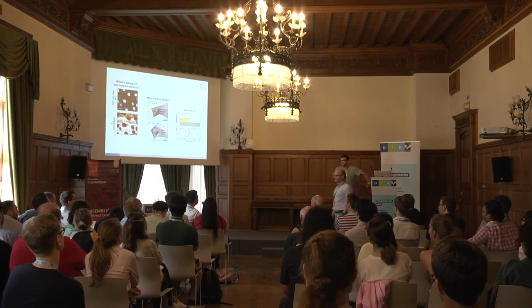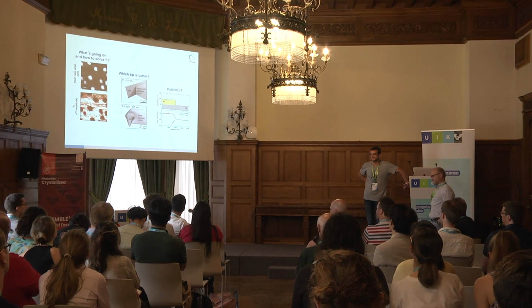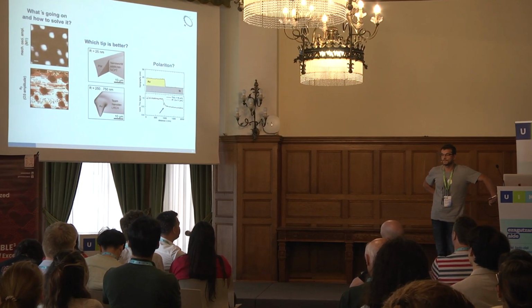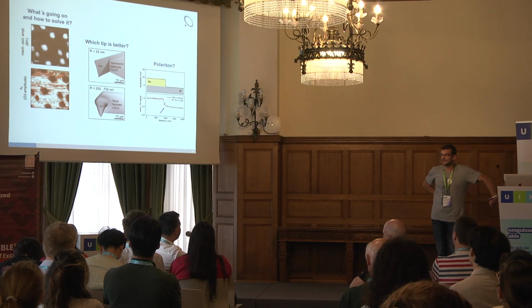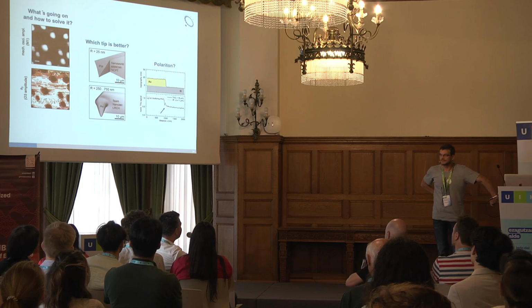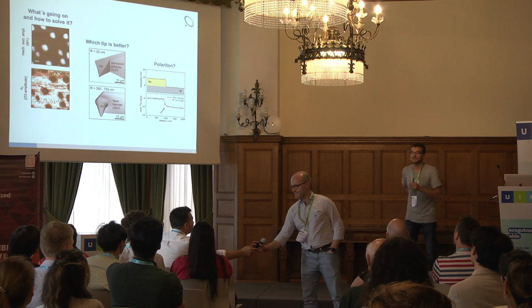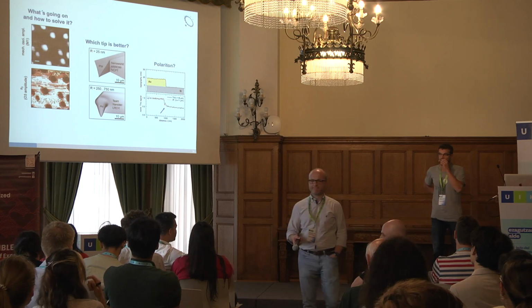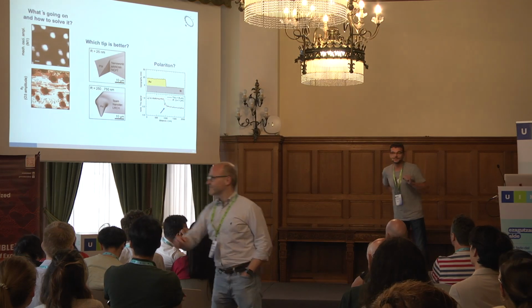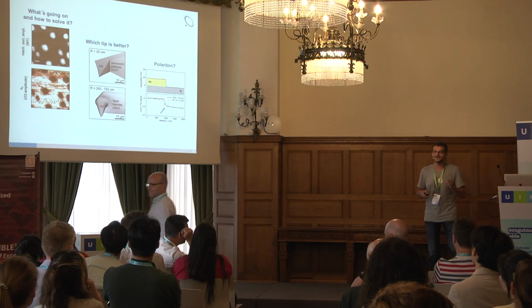So I've seen this before, and usually surface charge can cause this. So if we ground the sample in a better way, I already solved some problems. Okay. Yeah. Right, these things appear in similar effects. It's not the case here, but you're right. Charging may produce that too. It's actually related. I hope later on, with the help of our AFM experts, I will ask them, because I probably cannot explain it so well.